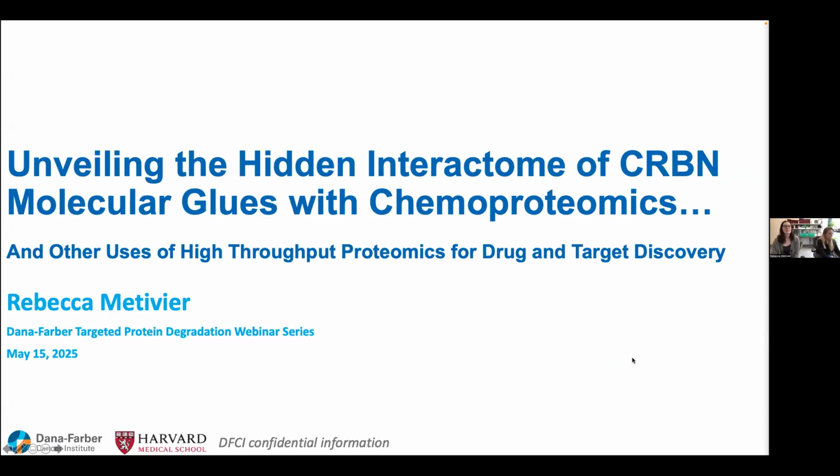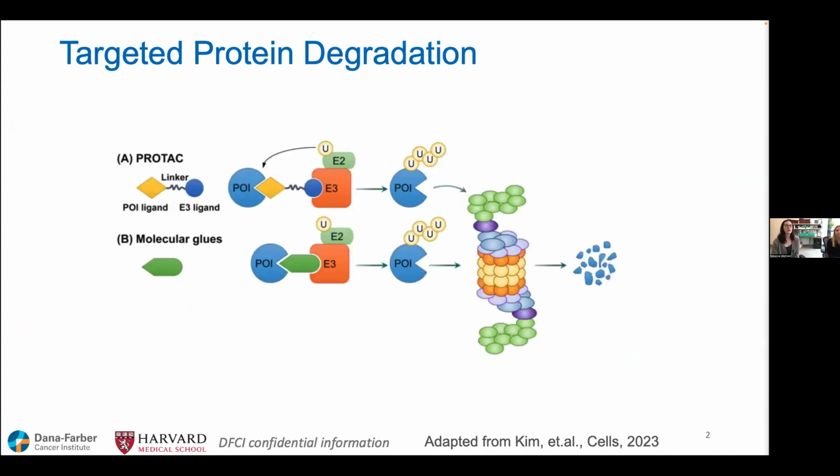Hello, thank you for joining today. So I'm going to be talking about some work that we've been doing in our group using proteomics to unveil these interactomes of ligase and compound combinations. So I'm sure most in this crowd are now familiar with the process of targeted protein degradation. Just to briefly summarize, TPD involves hijacking the cellular protein degradation system by linking a novel target to an E3 ligase using a PROTAC or molecular glue, which then leads to the subsequent degradation of this target protein. This can be highly beneficial in diseases such as cancer, where we can rid the cells of disease-promoting proteins.